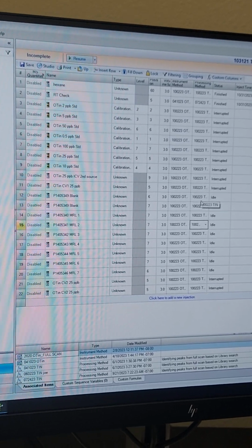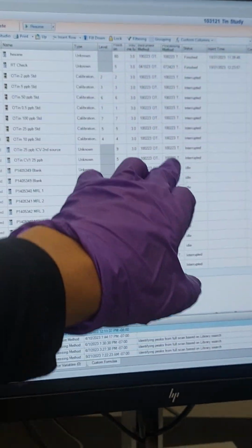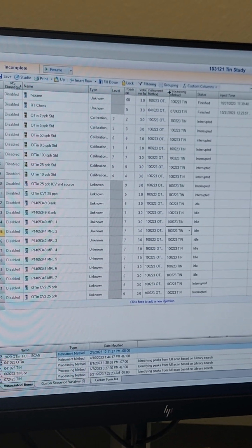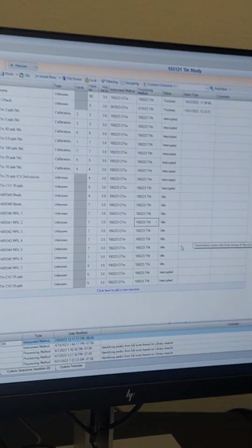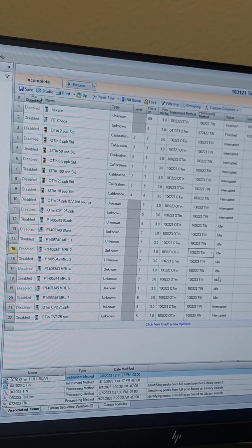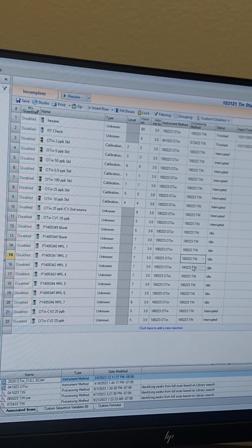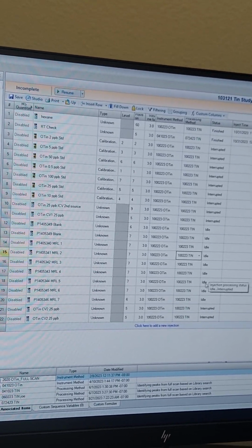But we start with the previous one. So the date is 10/02/23, and you use the same date. You don't change the date to today's date. We can later, but we don't need to, because it's just the method from the last time we ran it. And sometimes we don't change anything about it.